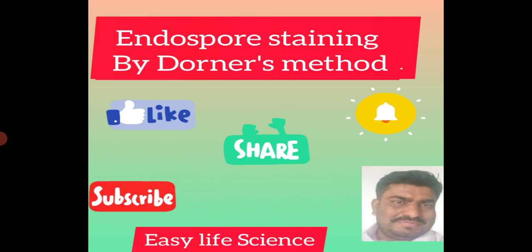Here I am talking about Endospore Staining by Dorner's method.